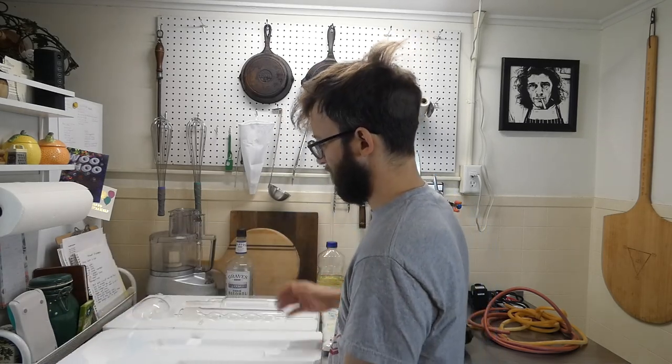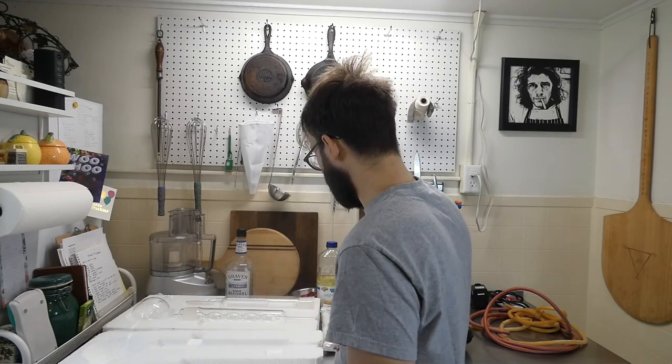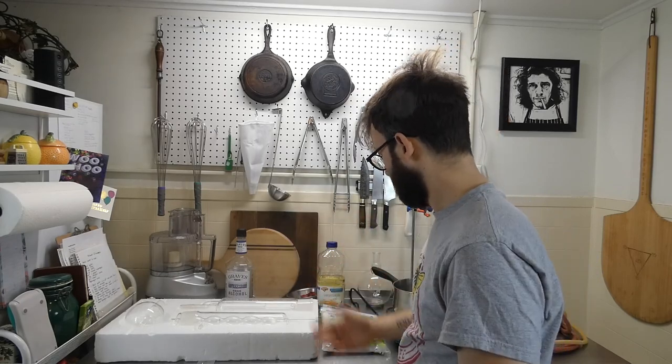I picked mine up on eBay years ago to do extractions. And all it really is, is a flask, a condenser like so, and the actual Soxhlet itself. I just washed this, that's why it's wet. Let's put this together and we'll go from there.